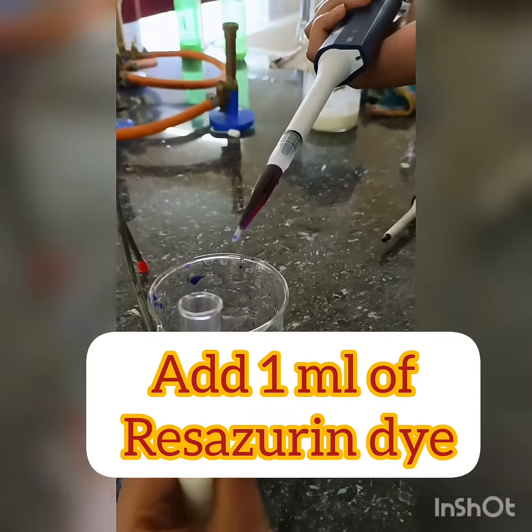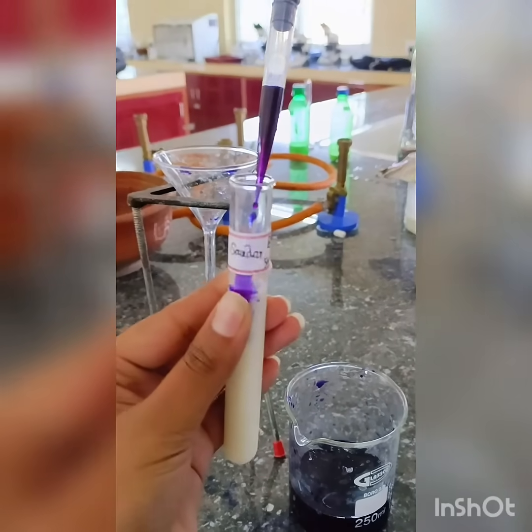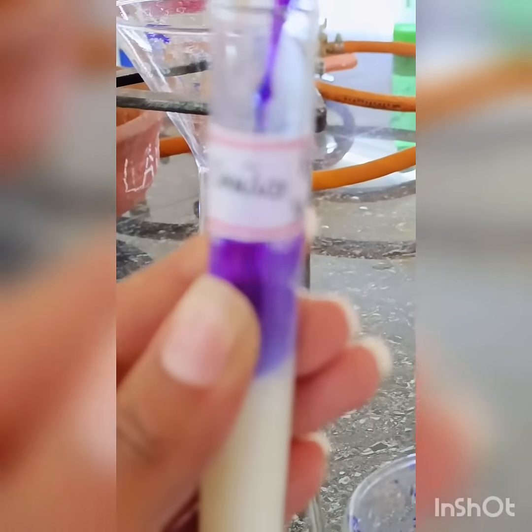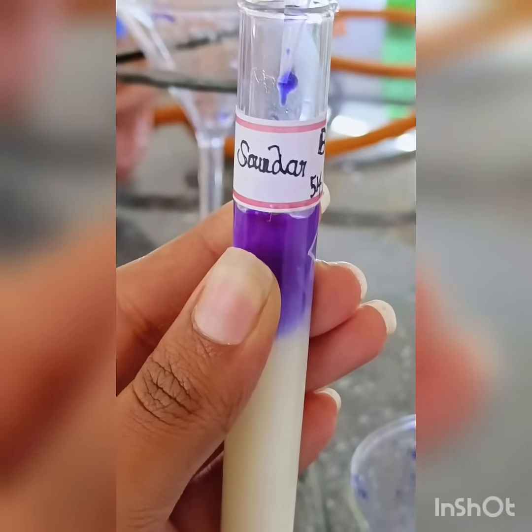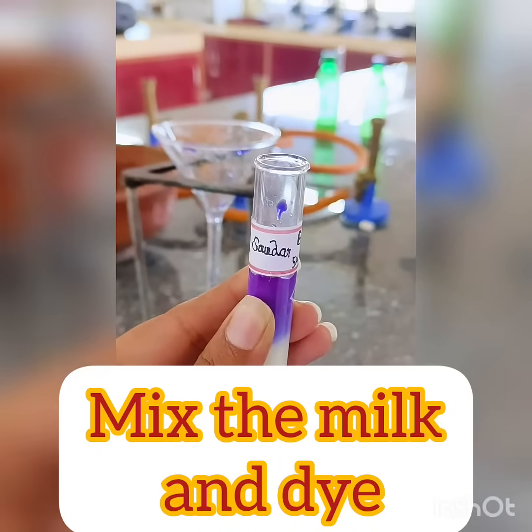To prepare the Resazurin dye solution, take 0.05 grams of Resazurin dye and dissolve it in 100 ml of distilled water, then vortex using a vortex mixer. Filter this solution using Whatman filter paper.